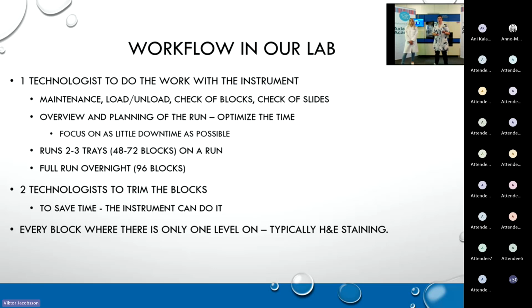The technologist will also overview and plan the different runs. We try really hard to optimize the time because we want to have as high an output as possible. So every run is planned down to the last minute, I will say. When a run is over, the next run is already ready. So you just have to unload and load, so you don't have that time gap in between. Again, it's just a focus on having as little downtime as possible.